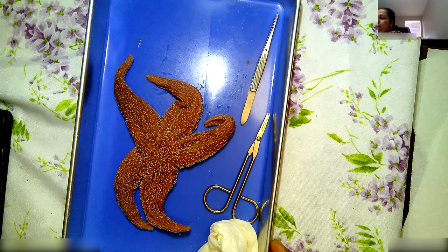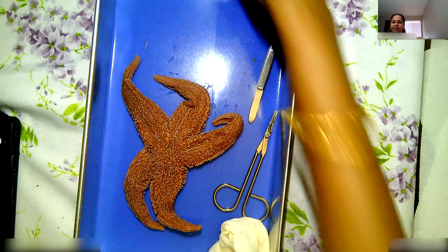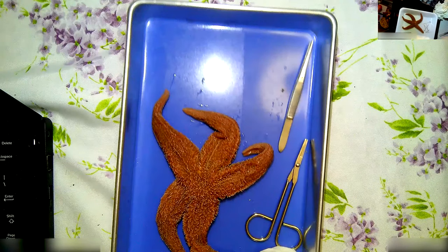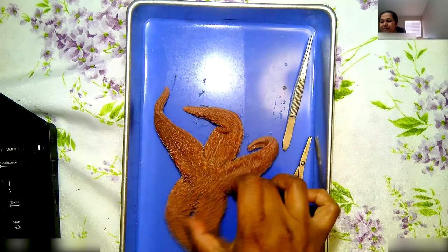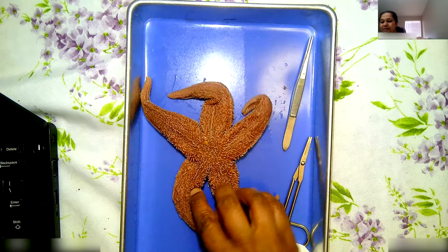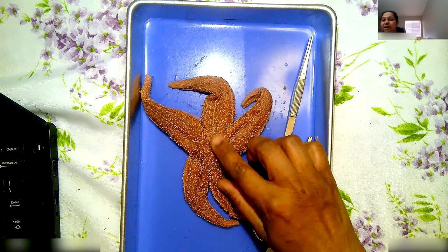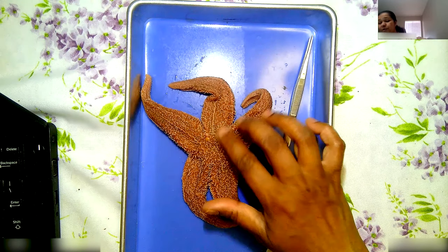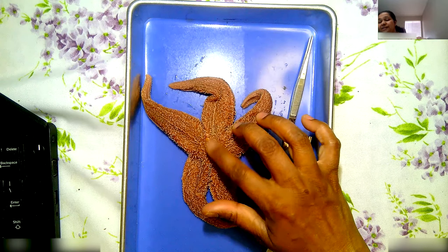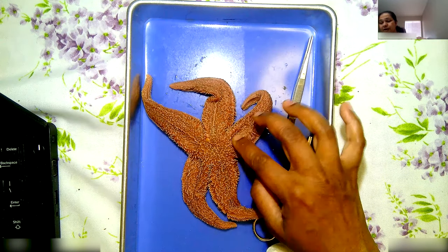Now listen to me carefully. See what I'm doing, and then you do it. All of you pay attention. First, I want you guys to feel the texture — it's like sandpaper, isn't it? Yes. So because it's like sandpaper, that's why the name: Echinodermata. This belongs to a phylum called Echinodermata. Echins are like the spines or spikes on the body — rough.